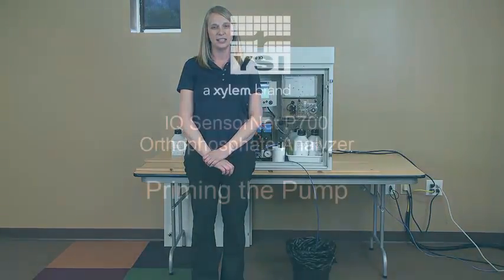Hi, my name is Laura St. Pierre and I'm a product manager with YSI. I'd like to review the P700 orthophosphate analyzer with you. The phosphorous analyzer that we have is integrated into our IQ sensor net system.